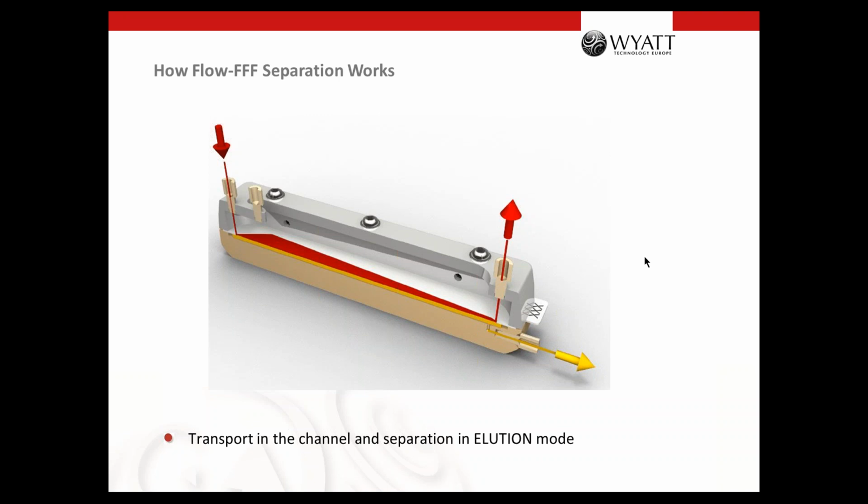But what we do now is we measure and control this flow with a Coriolis flow controller. This Coriolis flow controller measures the amount of flow with the Coriolis force. That's a very accurate measurement, which is absolute, and not a function, for example, of the density of the solvent.